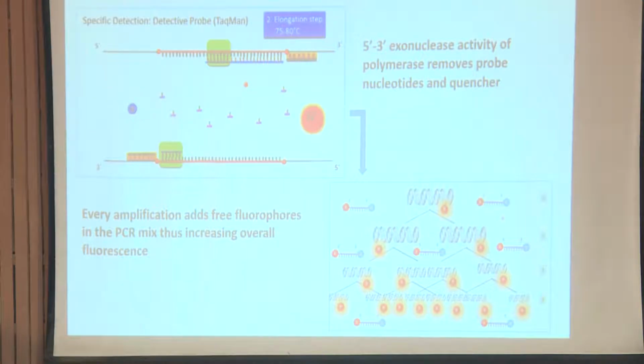Any one of you? Why is the double-stranded DNA not fluorescing here in probe based? I am asking you. Can you give a mic to her?